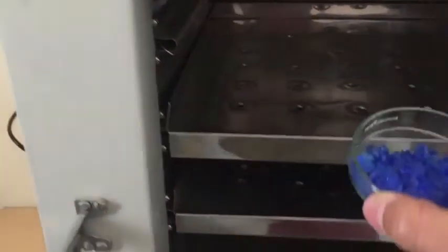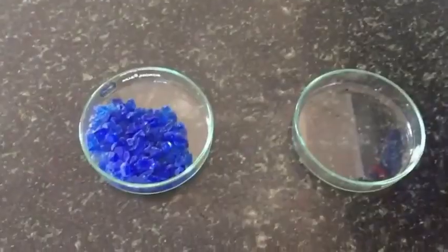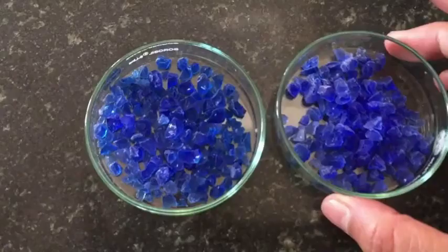After cooling down, you can see the color change. Here you can compare the colors — the left one is regenerated from the hot air oven and the right one is unused silica gel kept tightly in the laboratory. I hope you liked this video, thank you all for watching.